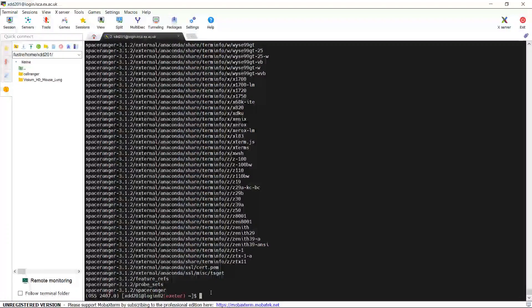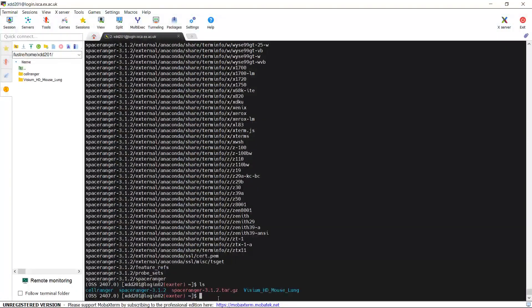Okay, it is done. We can have a look at the files in my folder. You can see we have the new folder named Space Ranger 3.1.2, and also here is the file we downloaded from the 10x Genomics website. We can remove this file.